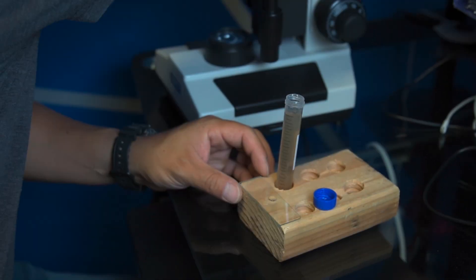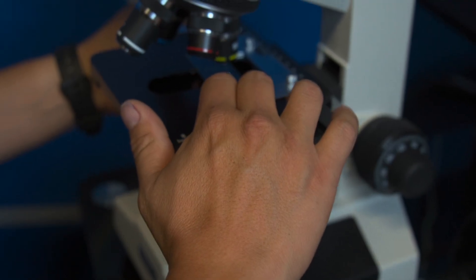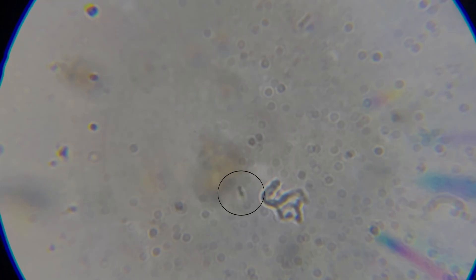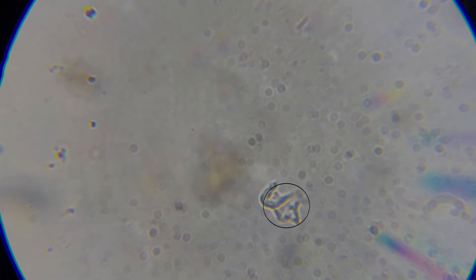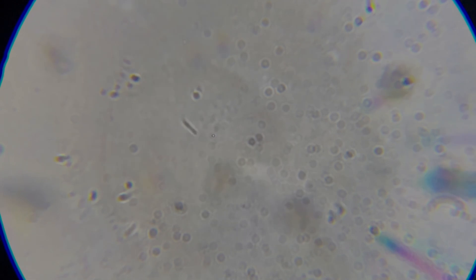Remember to check out part one on how to take a sample — you can click the card at the upper corner of the video. Now what we're looking at first is a flagellate. It's kind of hard to see, but you can see it in the lower center area — that bumbling motion and the size of the flagellate, along with their movement, is the indication of what they are.